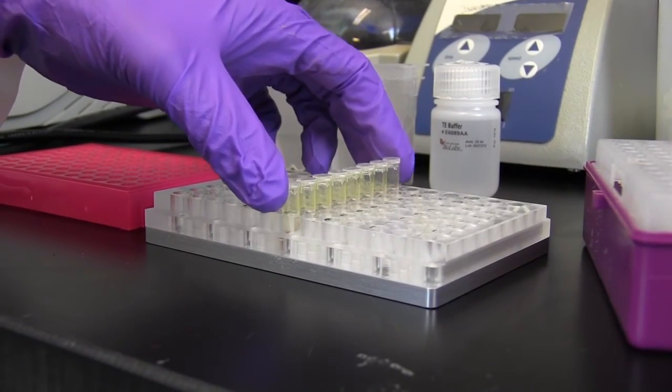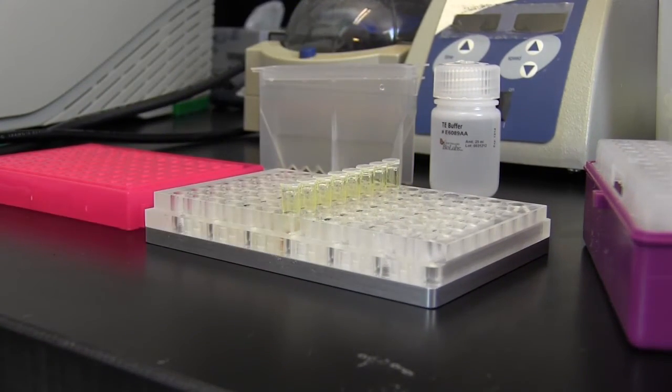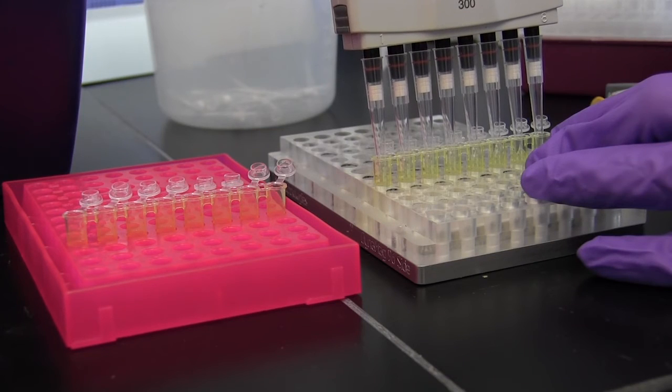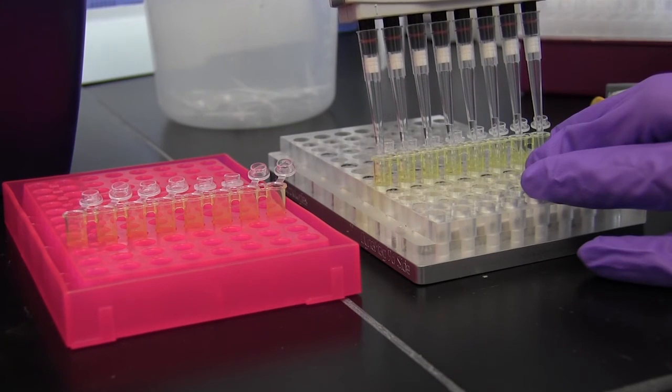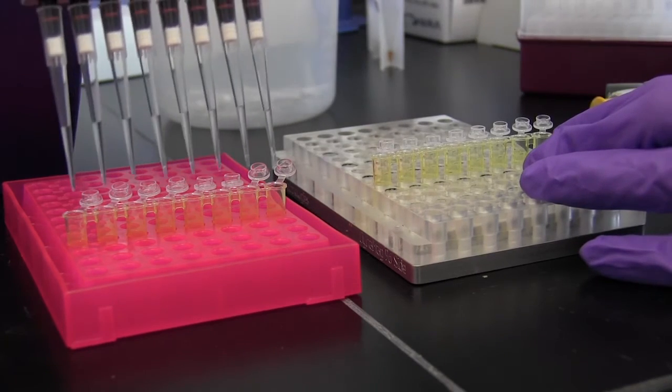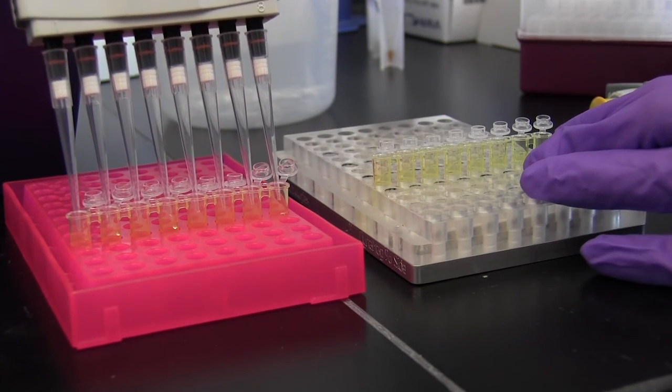Return the sample to the magnetic field until the sample clears, approximately 5 minutes, and remove 30 microliters of the supernatant containing the library to a new tube. This library can be stored at minus 20 degrees Celsius.